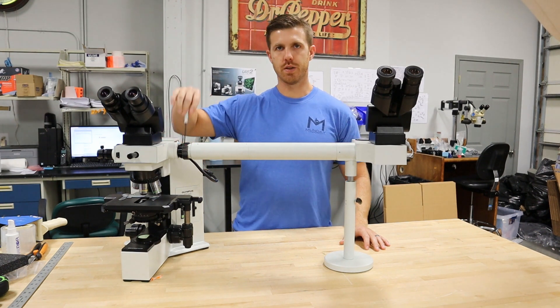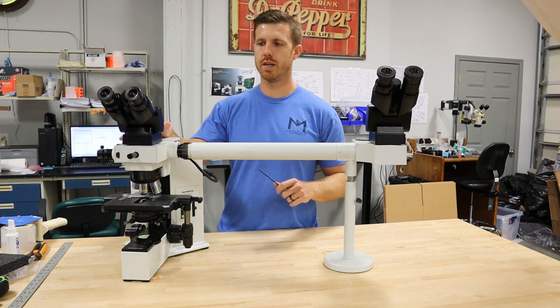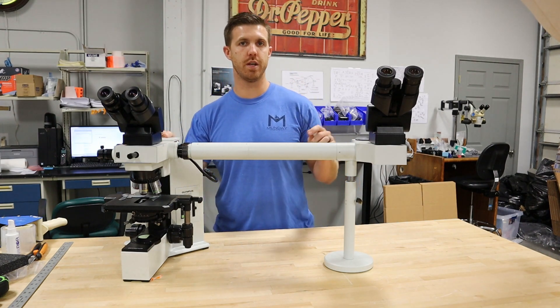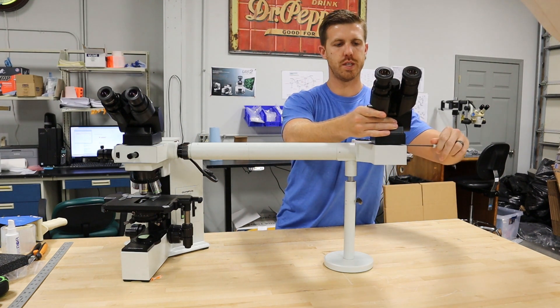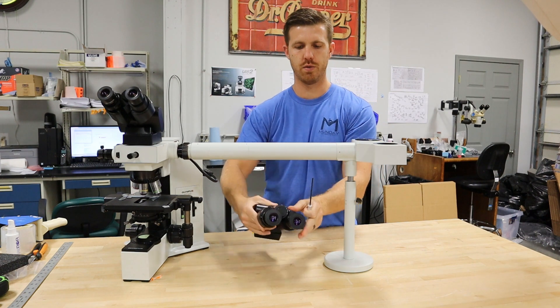So first, we're going to take the three millimeter Allen wrench. If it's not in the scope, you can buy an Allen key set. We're going to remove the heads. This is in our other disassembly videos — if you've got any questions, just view those videos. There's a screw hole on each side. You always want to tilt it back and make sure the eyepieces don't fall out.